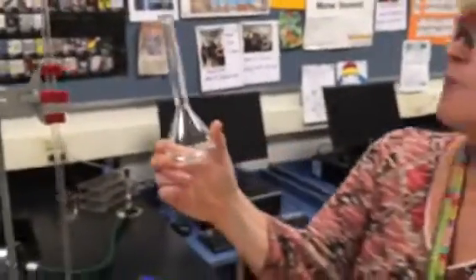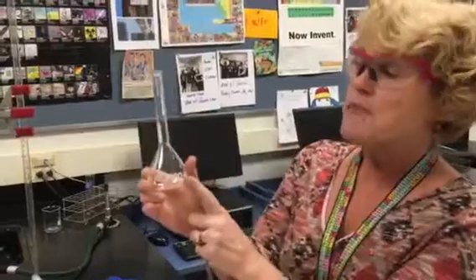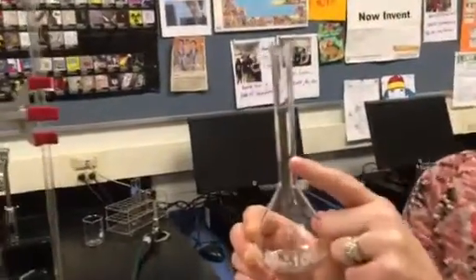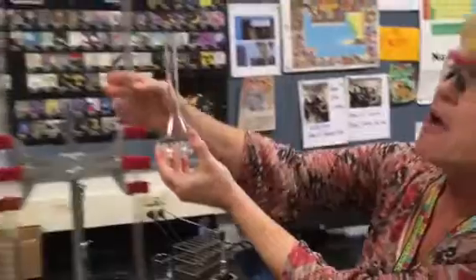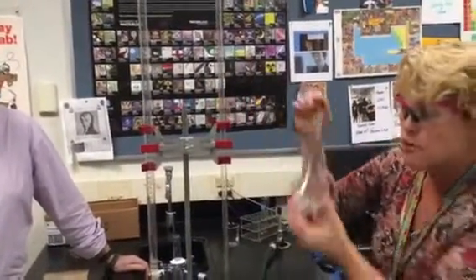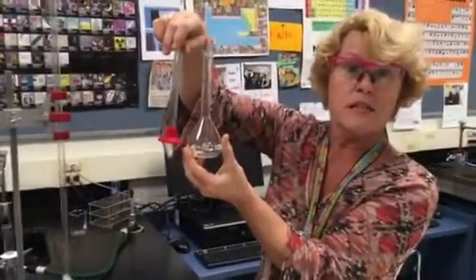Okay, now the next is the volumetric flask. We will be using this when we get to our mystery lab, the Clue game, the murder mystery lab. So you'll be making up solutions. Now, notice there's one line here. There are no graduations. So what do you do? You look at the diameter and compare it to the closest diameter. It compares to this diameter on the burette and also the diameter of the 10 milliliter graduated cylinder.